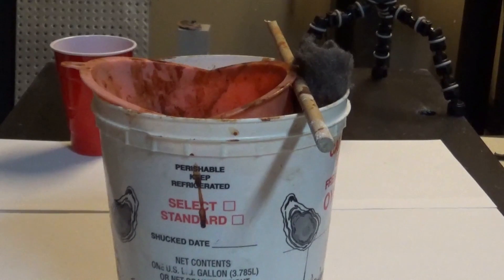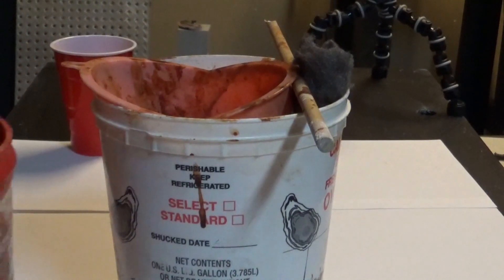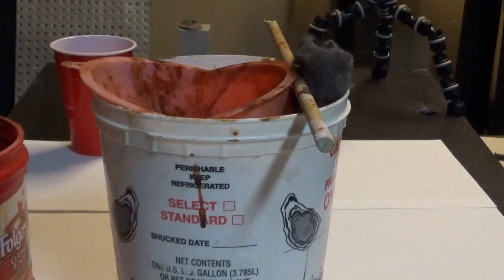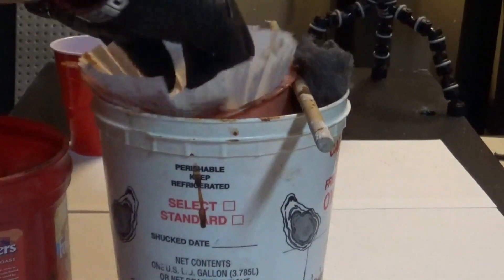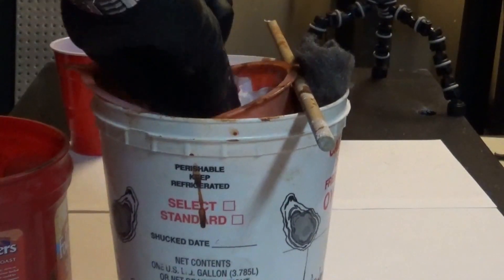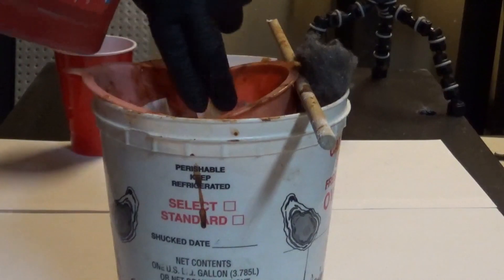Eventually I'm going to take that batch and filter it. Oh wait — I forgot to put a coffee filter in there. I'm supposed to have a coffee filter in there. Now we've got the coffee filter — let's put that in there. We're going to take this mix and pour it, letting it strain through the coffee filter. This is going to take a little while.